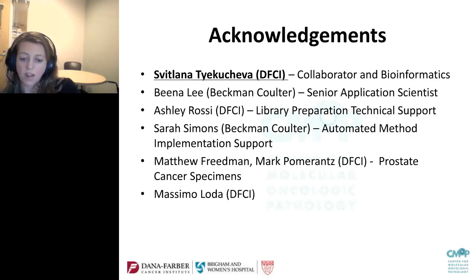So the next question I have here is from Marissa Needham from the University of Virginia. What method did you use to deplete the ribosomal RNA? We used Ribo-Zero. Ribo-Zero is the method we used to deplete the ribosomal RNA. We've looked at different ways of doing this, but the Ribo-Zero method is by far the easiest, simplest method, and we've had very good results with it.